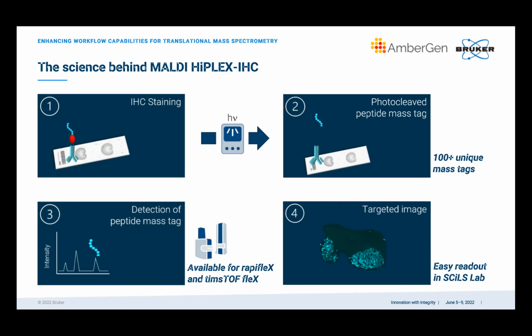It's really difficult when I get inside. I know that you're the world leader for the imaging system. So we want to get some kind of tens of targets from imaging analysis, some kind of markers. How can we approach this with MALDI imaging?